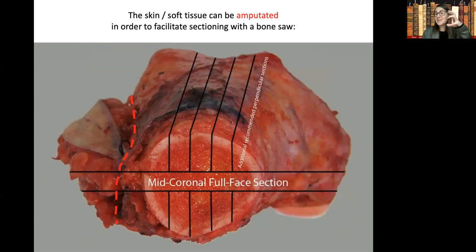The only reason that soft tissue is there is because they always resect the biopsy tract along with the sarcoma. That's for reasons of possible seeding of the biopsy tract from tumor as it's pulled out. So you should always generally expect to see an ellipse of skin with that underlying tract excised. It should always be sampled in the event that there may be tumor in there and sectioned, but the bulk of our interest is going to be in that bone, right?